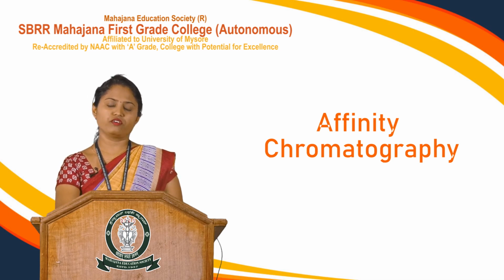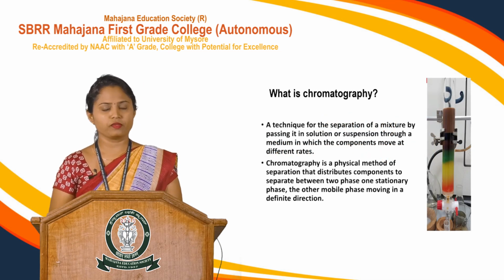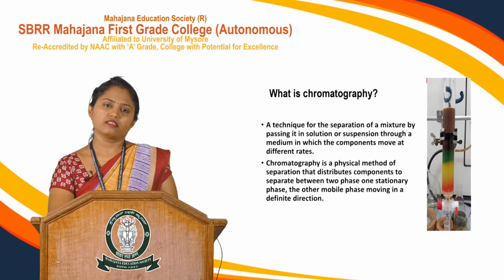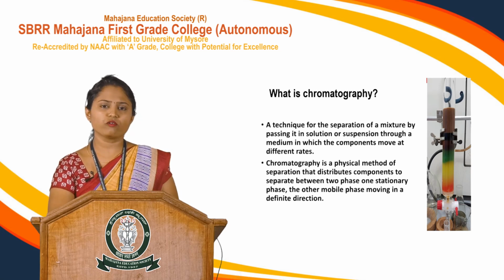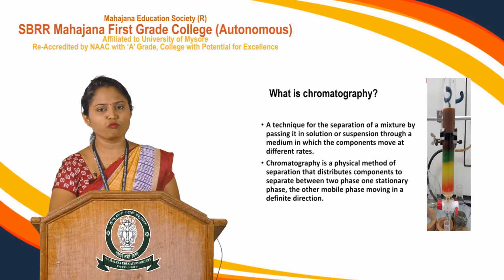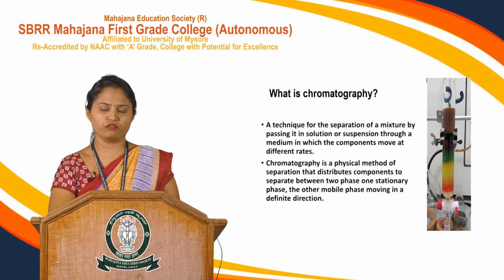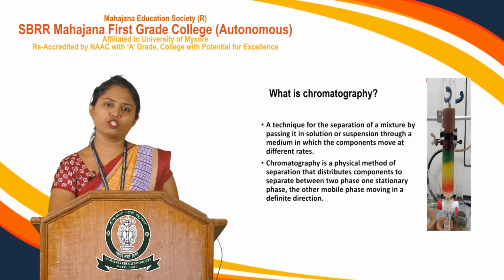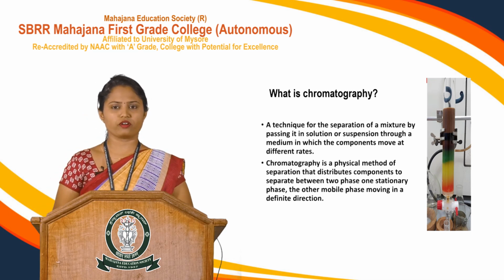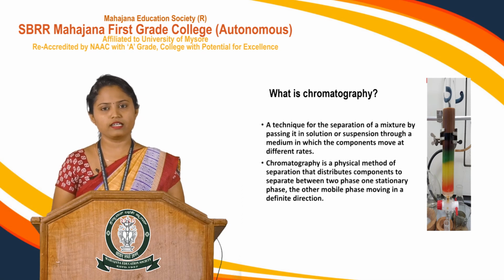To begin with affinity chromatography, let us first focus on what a chromatographic technique is. In the early 1900s, this effort was put in by the scientist Michael Tswett, who separated chlorophyll pigments and a variety of plant pigments based on the principle of partition coefficient. That led to the foundation for the discovery of various chromatographic techniques, from planar chromatography to advanced techniques like UPLC and FPLC.